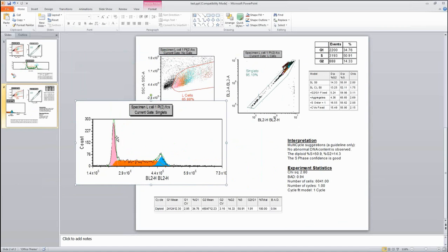And with all the formatting options we have, if you needed to change anything about the colors or the fonts on here, you could do that in FCS Express rather than putting another little white text box over the axes labels in PowerPoint or in Photoshop.